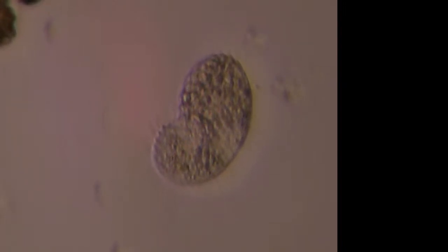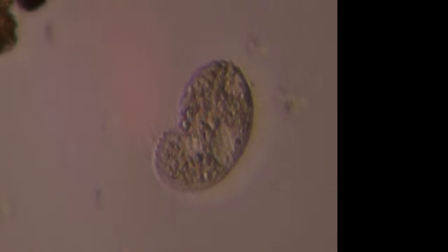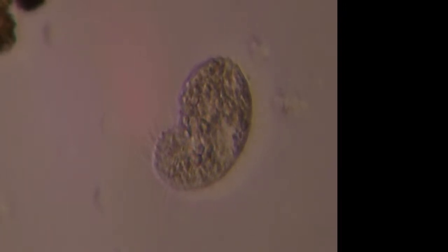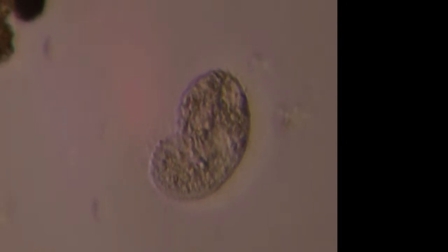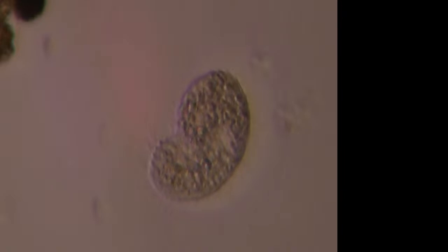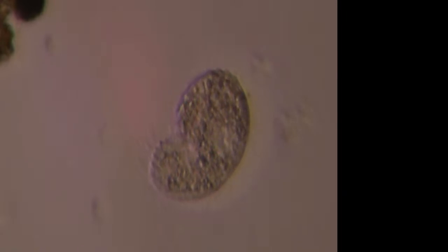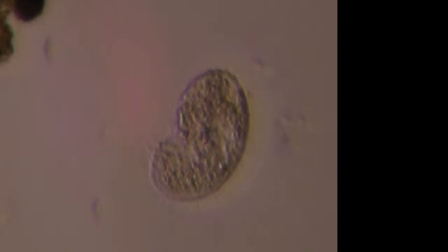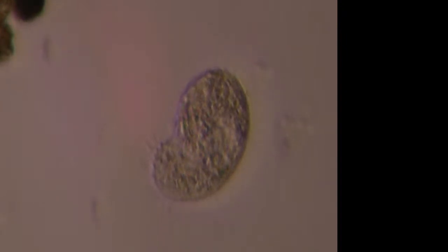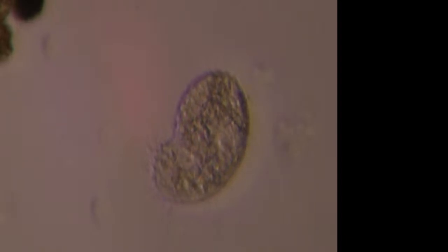Some other guys have posted videos online of things swimming, and they start breaking apart, and the rest of them just keeps on swimming like nothing's happening, but the tail end is already gone and disintegrated. It's really bizarre. It's like part of the cell just keeps going, the rest of it is gone. Kind of like when insects are being eaten by other animals, they can actually lose a good chunk of their body and still maintain some sort of life. The body's still moving, the legs are still moving, but half the body can be gone and they're still going.